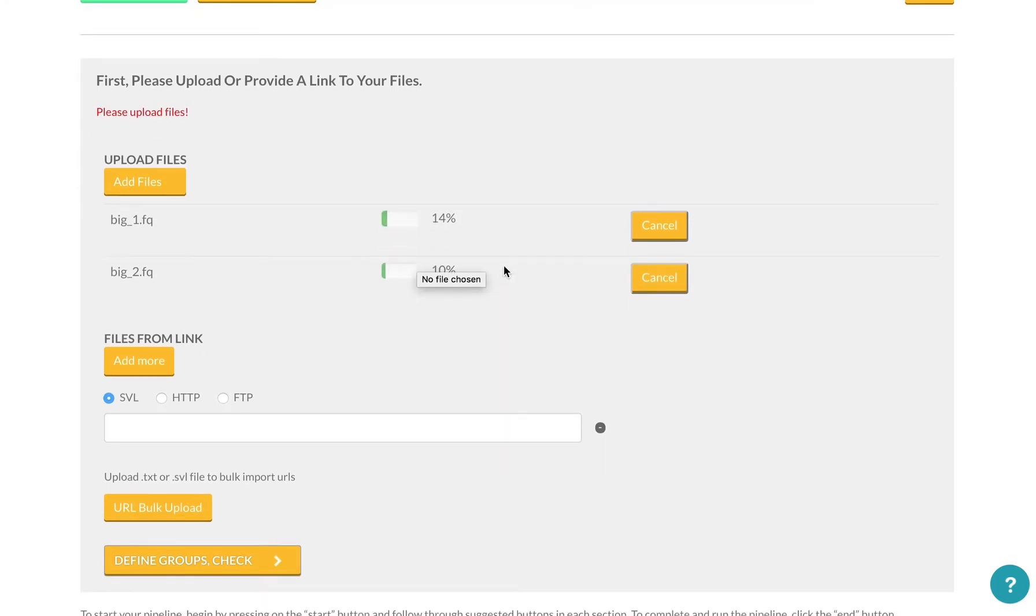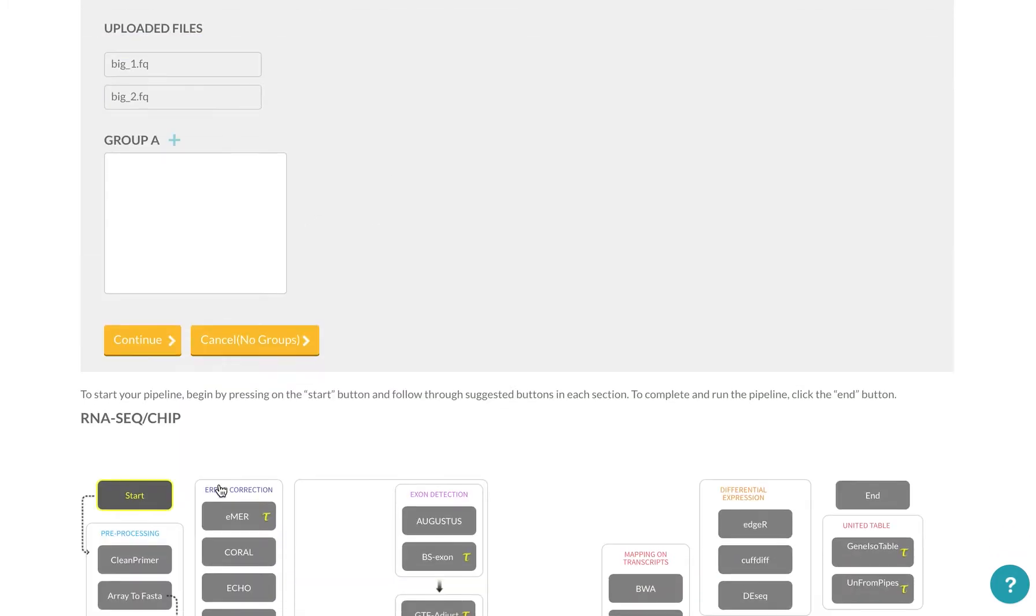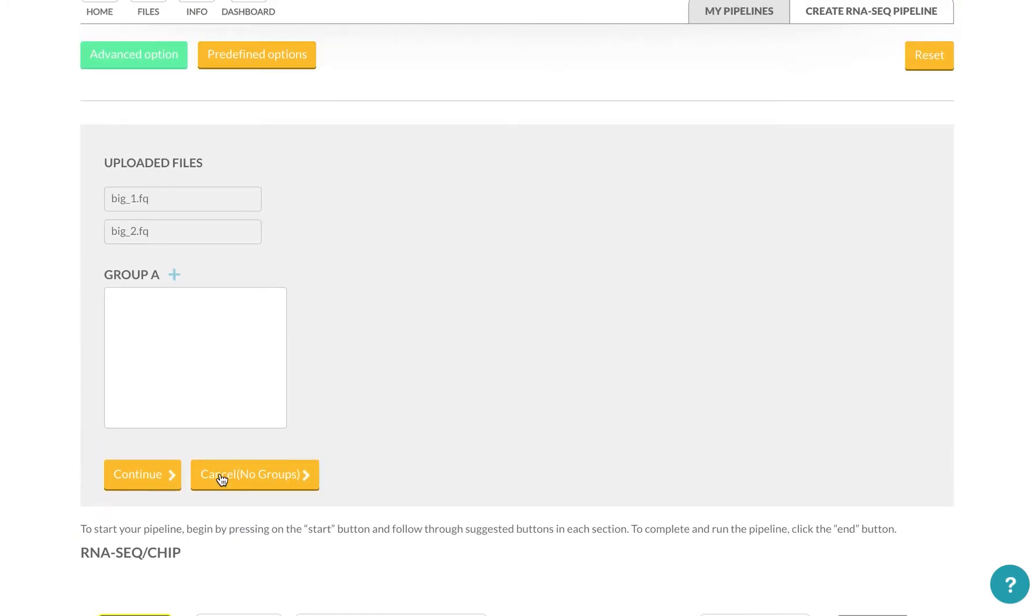And then once they are done or as they are uploading, I can define the groups, and I can make a number of groups here, or I can cancel this option altogether if I don't want to separate the files into any groups.